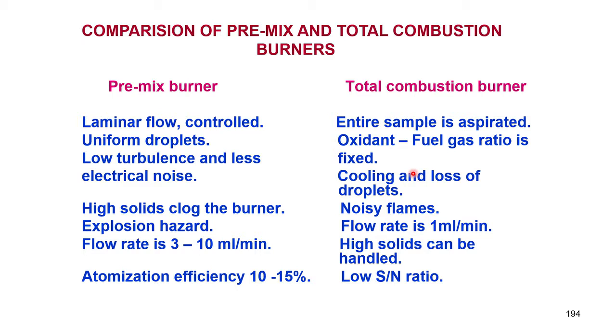And then the oxidant fuel gas ratio is fixed in the total burner, because you do not have control over the oxidant nor the fuel gas. So, everything as it comes out from the cylinder is burnt. Okay. Then because of this, and because a lot of sample comes into the flame, it becomes noisy.